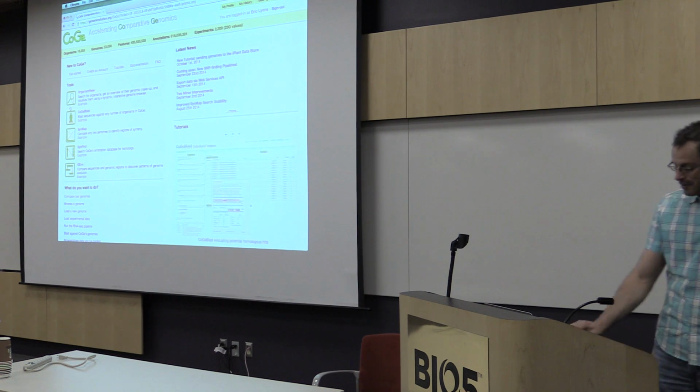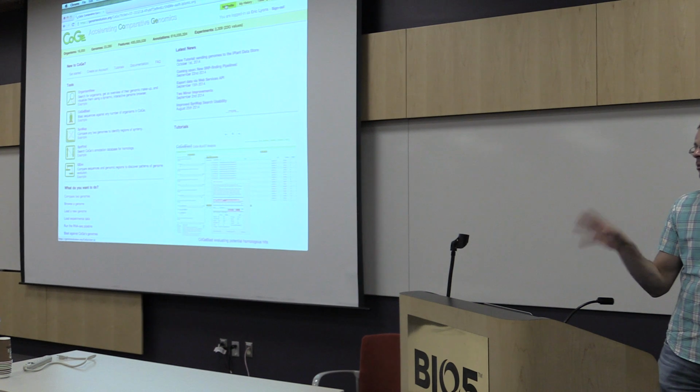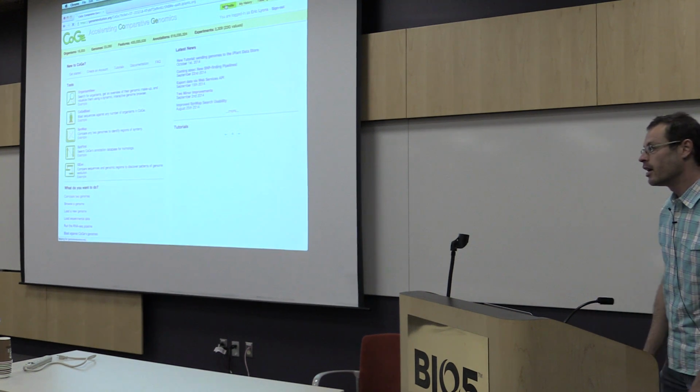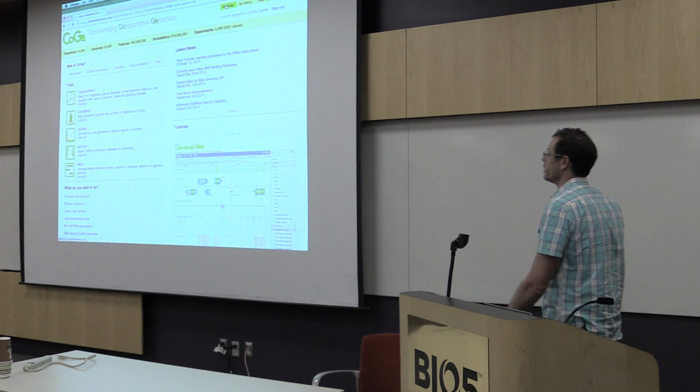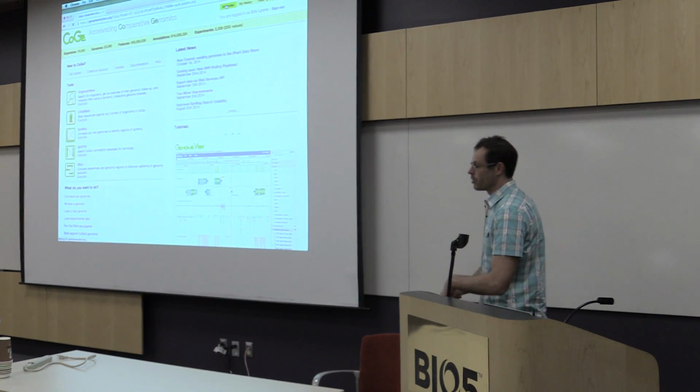So again, there's a lot to CoGe that I'm not going to cover today. We're just going to focus on doing RNA-seq and integrating it with the genome. So what I want you to do is click on the My Profile button in the top right corner.